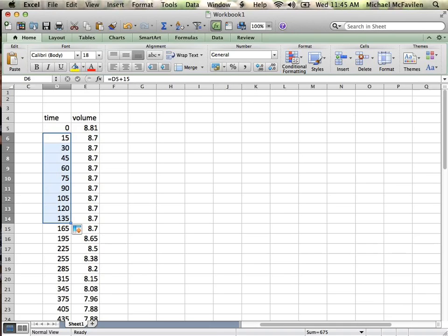So the click and drag does the calculation repetitively for each of those sequencing downwards. And now I've got all those numbers in there very, very quickly, and I didn't have to enter each number. This is something that will become increasingly important with the larger calculations, which you'll start on probably Monday or Wednesday of next week. When we do the rate law experiment, you're going to want to use Excel to do all your calculations for you, because you'll have to run the calculations 8 or 9 times, the exact same thing. So you'll want Excel to do all the complicated stuff.